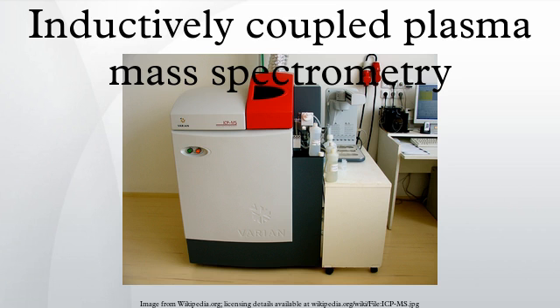If there are to be multiple ICP-MS instruments running for long periods of time, then it will most likely be beneficial for the laboratory to install a bulk or micro-bulk argon tank which will be maintained by a gas supply company, thus eliminating the need to change out tanks frequently as well as minimizing loss of argon that is left over in each used tank as well as downtime for tank changeover. There are rare ICP-MS solutions that utilize helium for plasma generation.